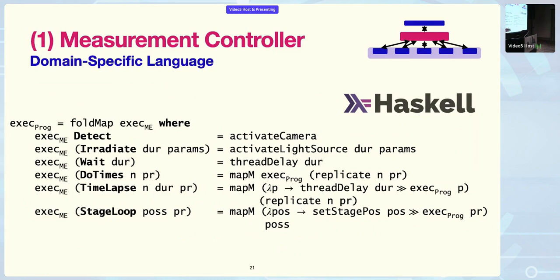Yeah, so that depends again on these three parties. The real domain experts, they don't like the idea of programming. So they use these buttons, they use the interface. But for instance, if I want to construct a program, or some of my lab members that do like programming, they will start to use a terminal, which is also possible. But it's mainly about the idea of programming. If you're not trained for it, you like the interface more.